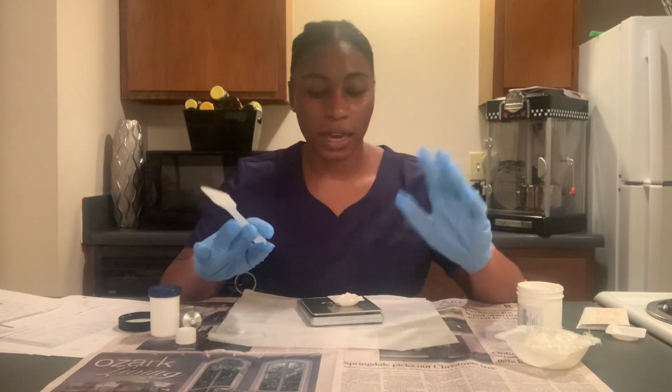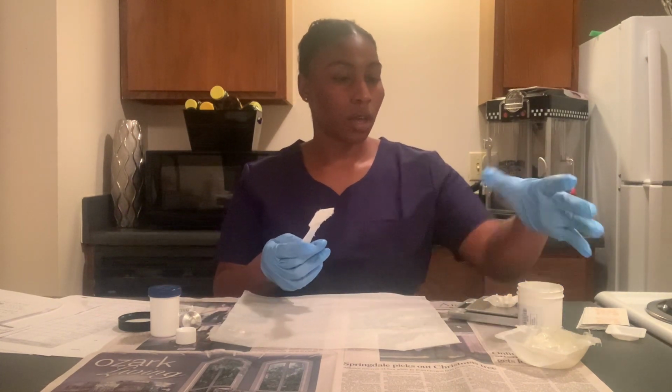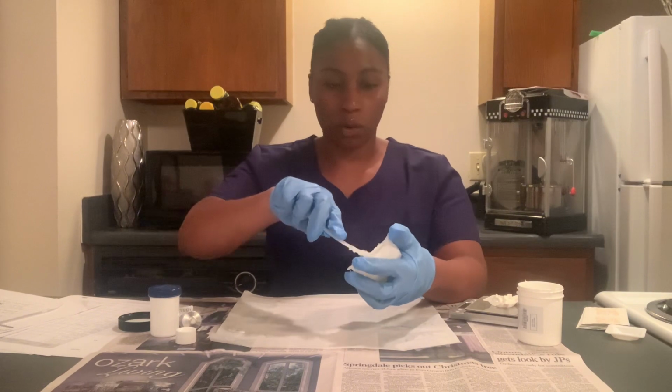Okay, so now that we got our nitroglycerin ointment and then we have our ointment base, now we have to mix the two together. So that is what I'm gonna do. So we have to, this is our ointment base and our weighing boat. So I'm gonna put this down in here, down on the ointment paper.